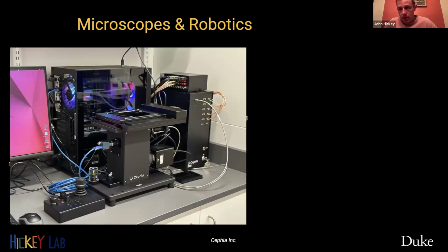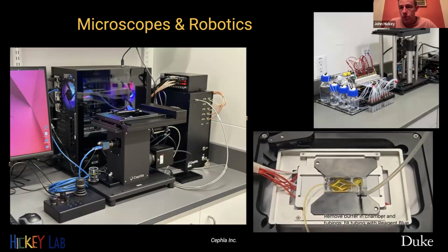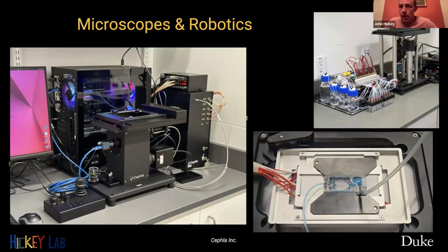These are microscopes that are powerful enough to see our cells and are also paired with our computers, which allows them to be automatic and to image terabytes of data without us having to be there and take every picture. We can connect this with fluidics that also allows us to do many experiments at the same time and many different steps and reagents that allow us to take many pictures and look at many different things about our cells at once. And so we can combine these robotic fluidics with these microscopes to do really cool things.